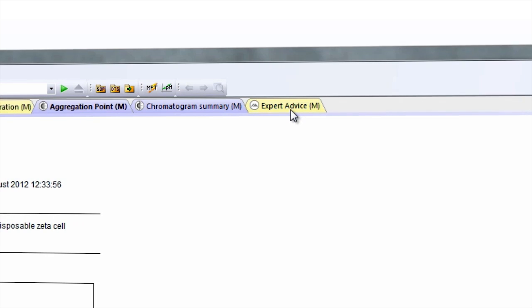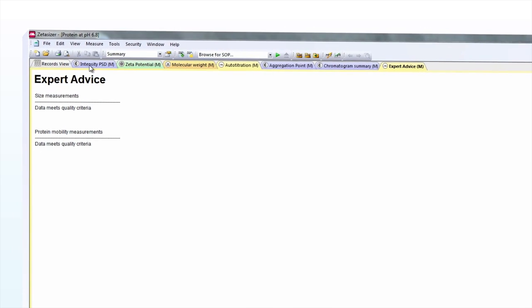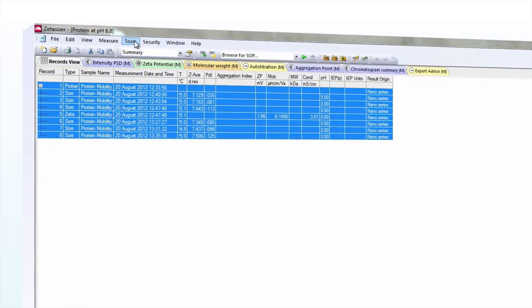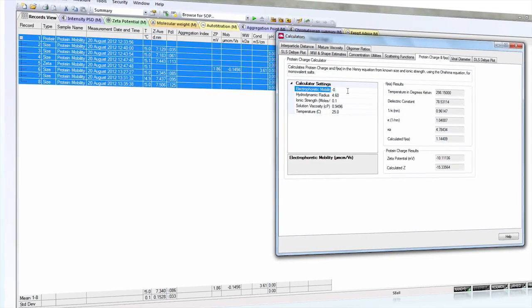The expert advice assesses the data quality to provide the user with information and advice on measurement quality. Having measured the Protein Mobility, the Protein Charge Calculator can calculate the actual protein charge.